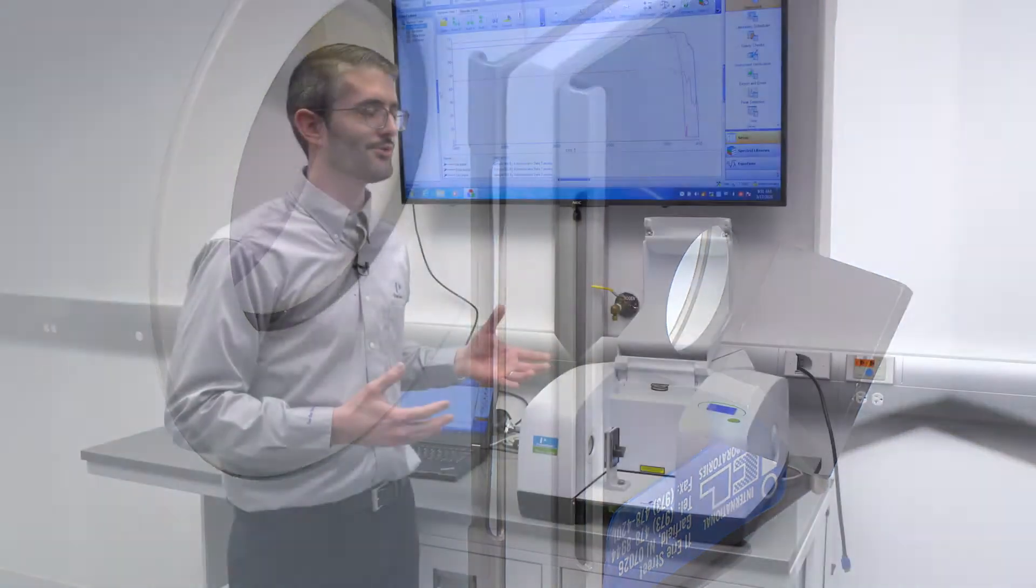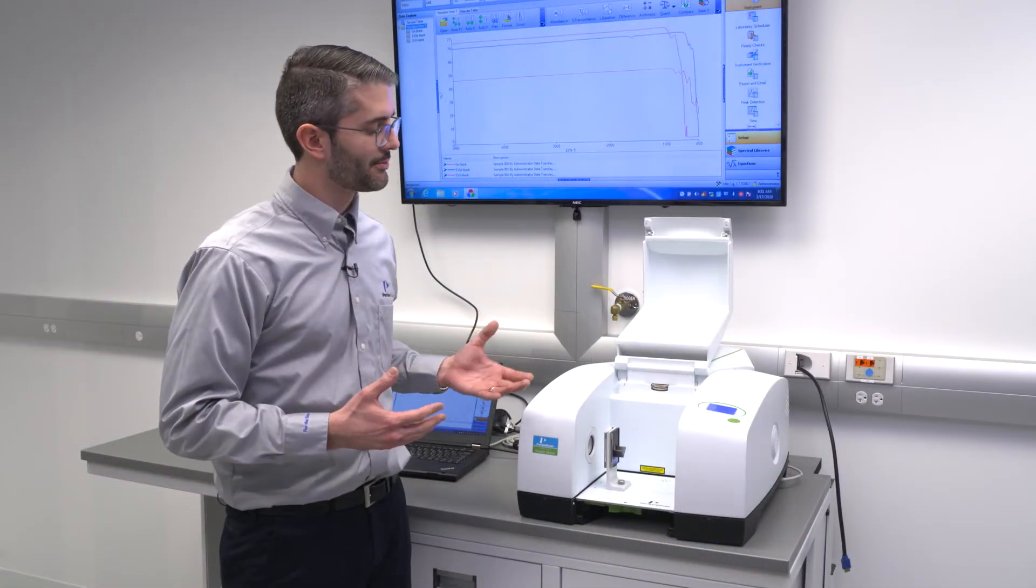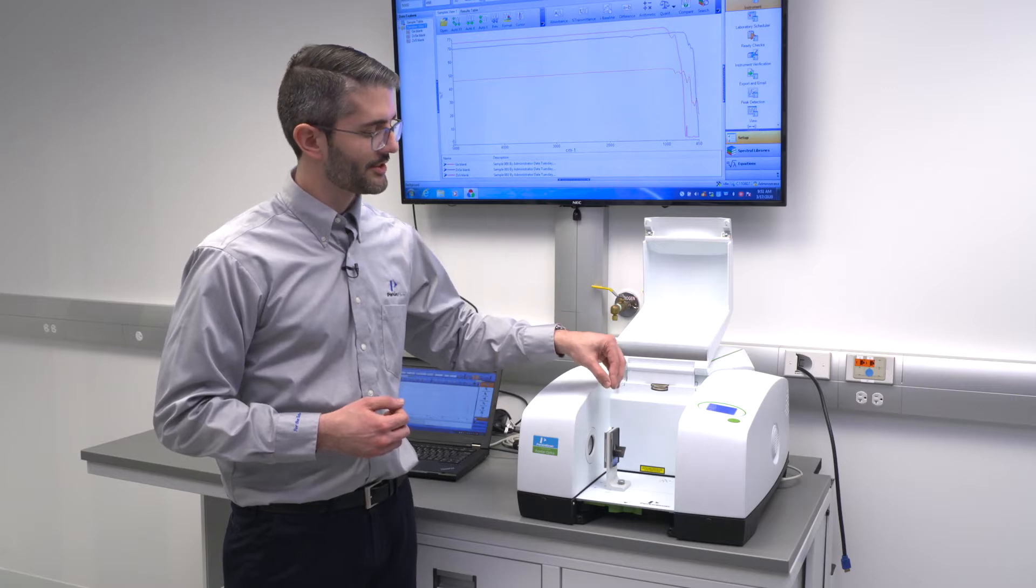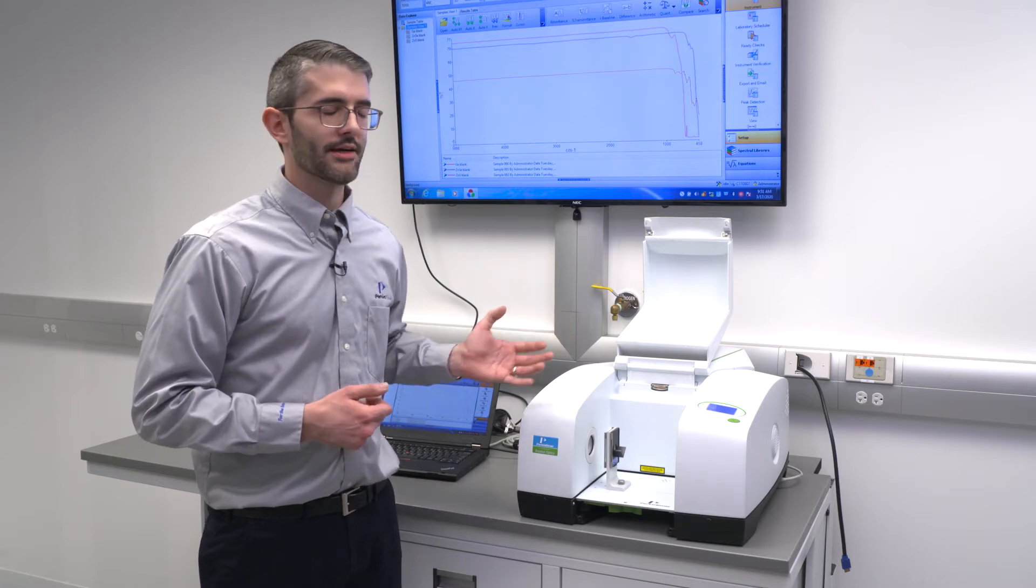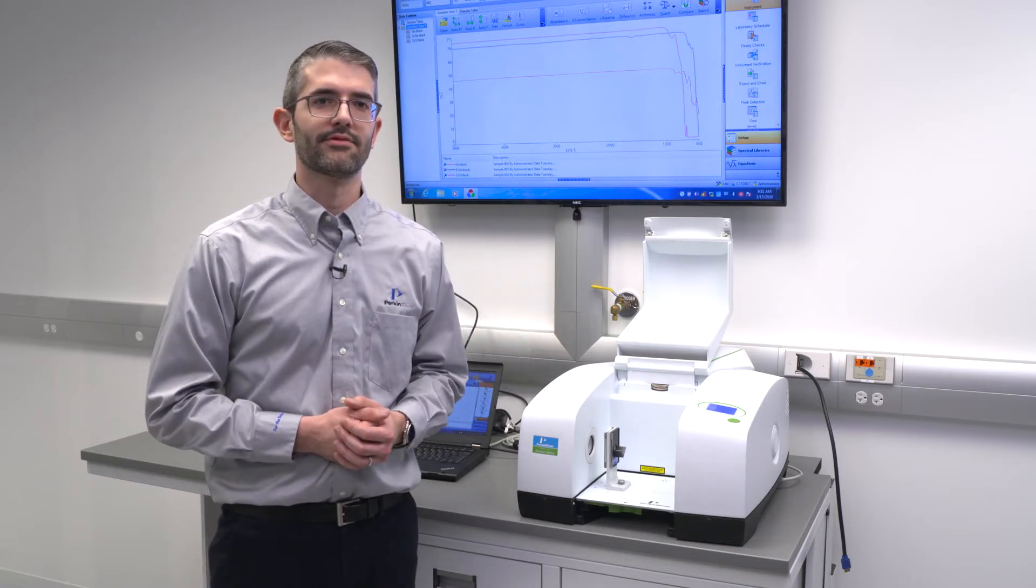In ordinary FTIR systems which do not incorporate these sorts of design benefits, some portion of the incident light on the sample can actually pass back into the interferometer. This causes inaccuracy in measurements and affects the final result.